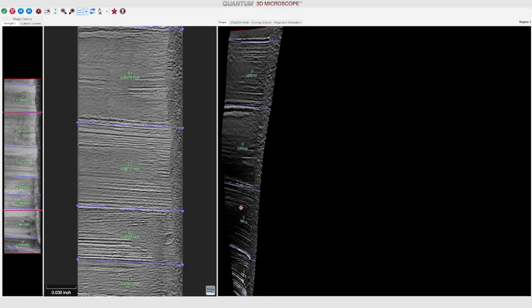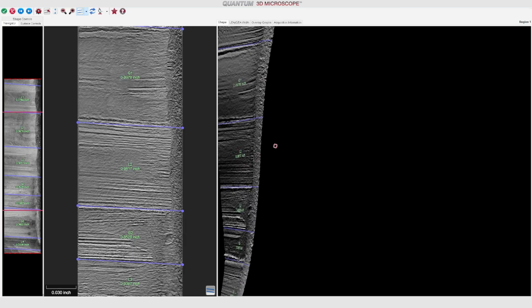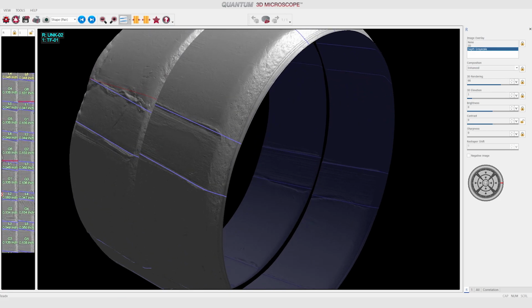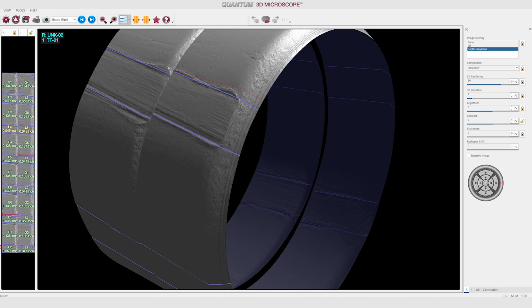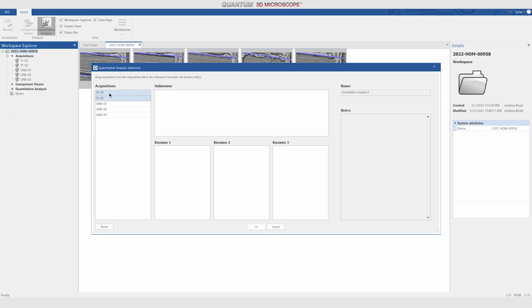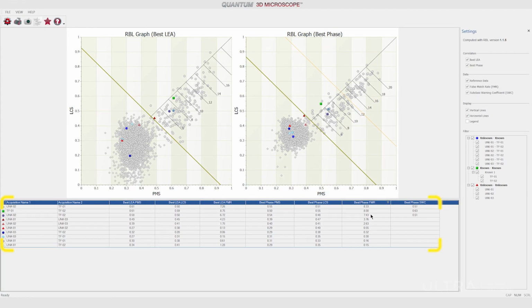Since viewing is based on the 3D topography, virtual comparison microscopy can be very effective, with the many display controls available to the user. Quantum's high-quality 3D viewing and intuitive operation enable a firearm examiner to reach conclusions rapidly and confidently. The leap in technological innovation is most evident with Quantum's quantitative analysis capabilities, where the 3D topography measurements are compared using algorithms that generate objective similarity scores.